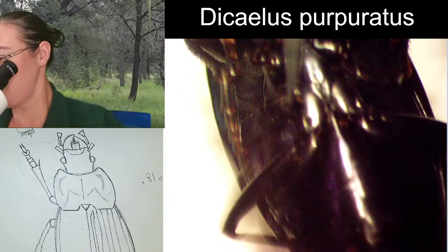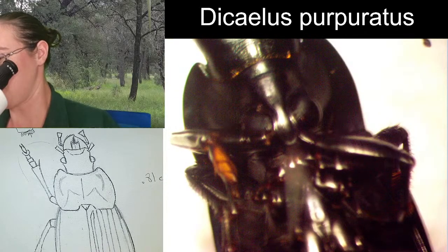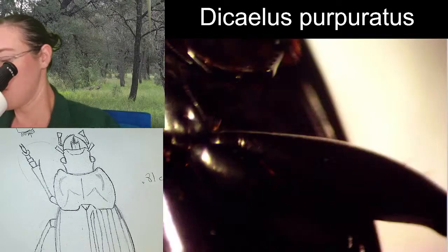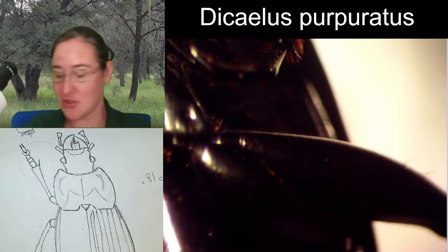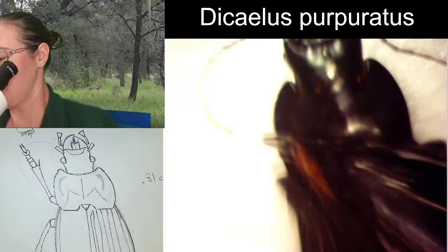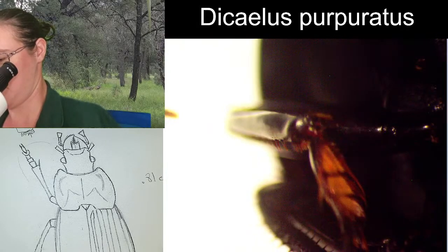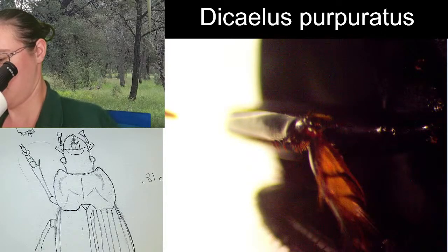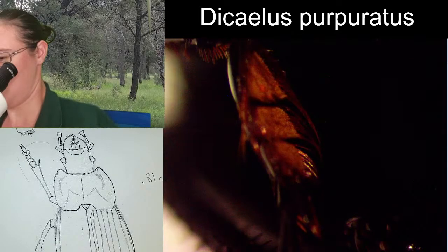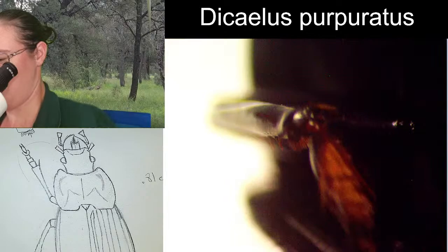Black beetles, where they're not metallic, tend to be a little bit tricky. But they have this expanded trochanter on the hind leg. Ooh, check this out. Cool! How much you want to bet this is a boy?